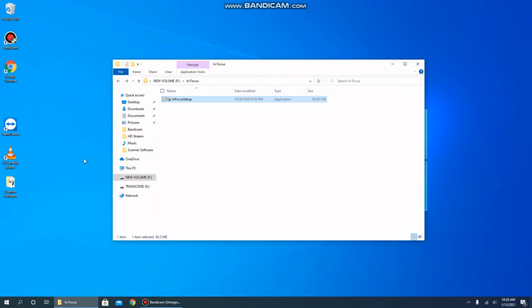Hello, in this video I will show you how to install and view a live image of the InFocus microscope software. The InFocus software should be provided on a USB stick or CD with the camera, and can also be provided via a Dropbox link that we would be glad to share with you.